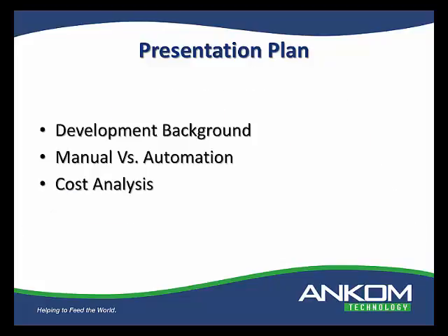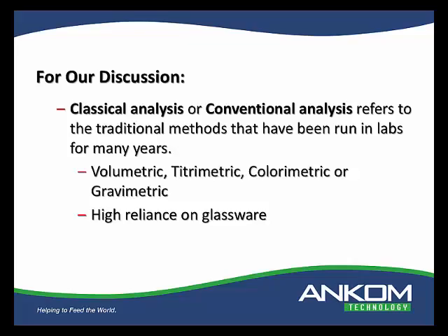So I'd like to give you a plan for the presentation, so you know where we're going. We're going to start by talking about the instrument development, certainly not through the whole instrument. That can take a long time. It's got quite a history. We can talk about that at a different time. I think we need to cover some of the basics so you can understand how it saves time and money. After that, we're going to compare the manual versus automated procedures, and then the core of the talk is going to be reflecting the cost analysis.